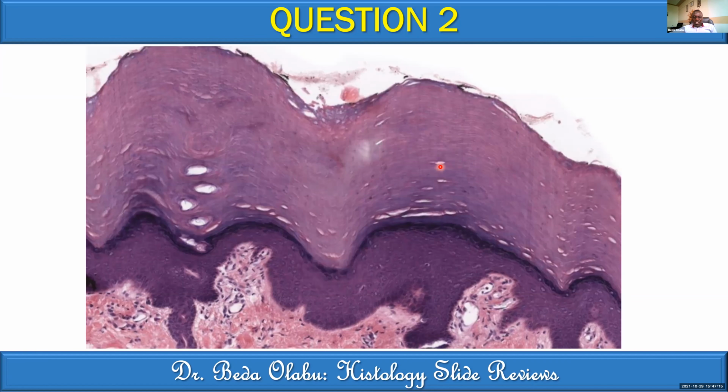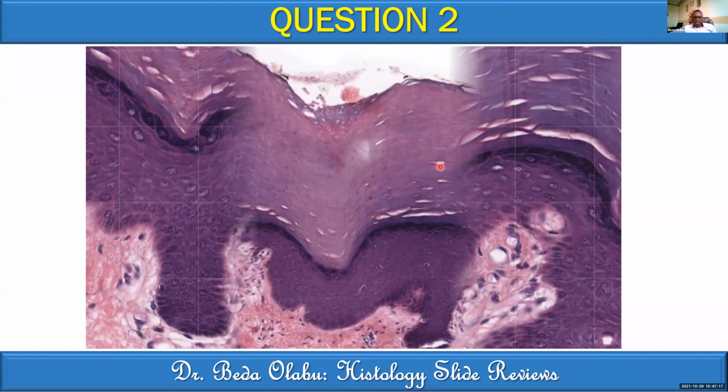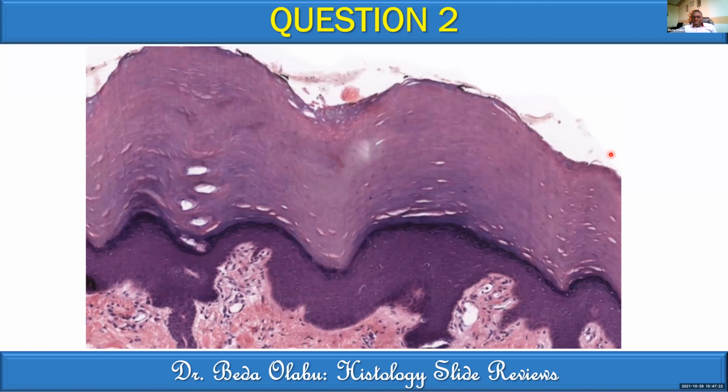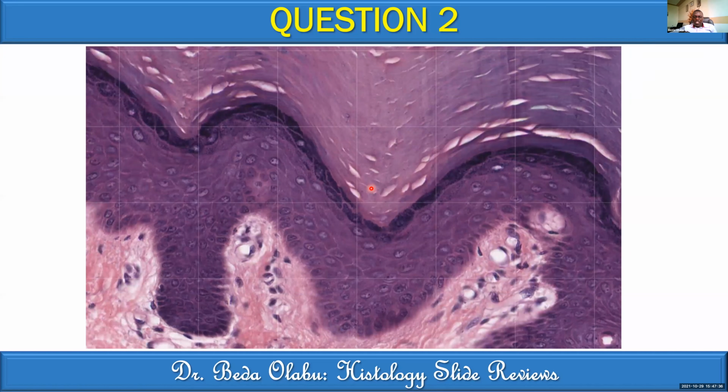I think I have 2 magnification levels for this, that level and that level. Okay, I'll give it to Joseph Mbugwa. This is a keratinized stratified squamous epithelium. Okay, so that is okay. We can just change the order in which you've said them. So we said stratified squamous keratinized epithelium. Good, we're doing well. I'll give you a third one.